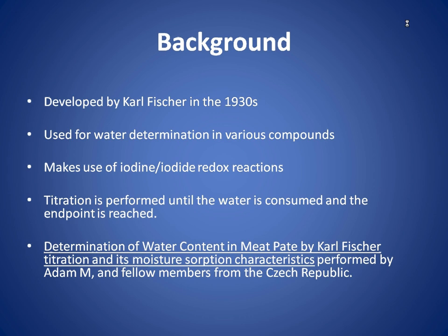Generally, titration is defined as the process in which one solution is added to another solution, such that it reacts under conditions in which the added volume may be accurately measured. More specifically, the water concentration in Karl Fischer titration is accomplished by using an iodine-iodide redox reaction.